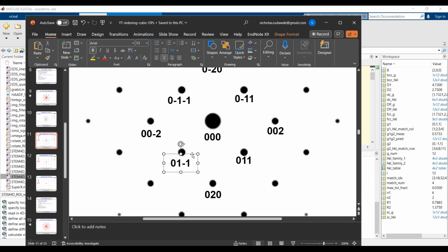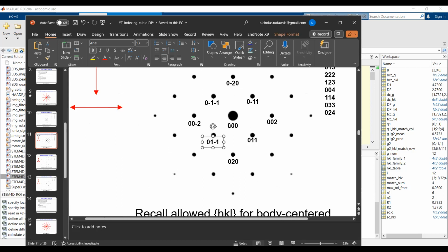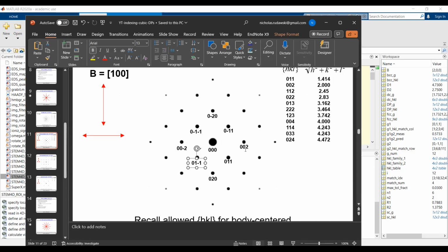And again, as a sanity check, we add these two together. Yep, we get 0, 0, 2 bar. And then you could finish the rest of these off the same way. I do have a 0 dot product between B and all of these indices, so we're good. Now, if we wanted to apply the soft rules, we would rearrange this as 0, 0, 1.